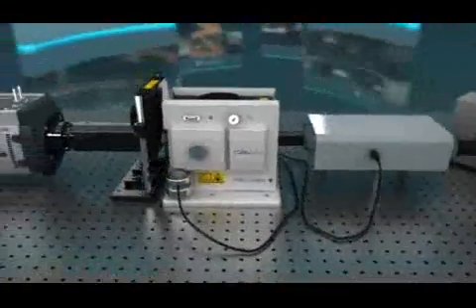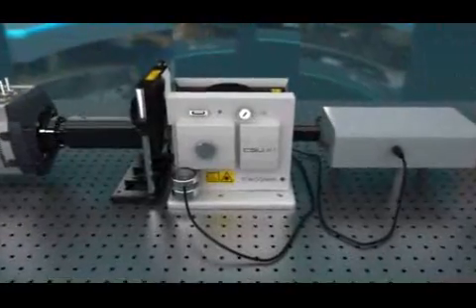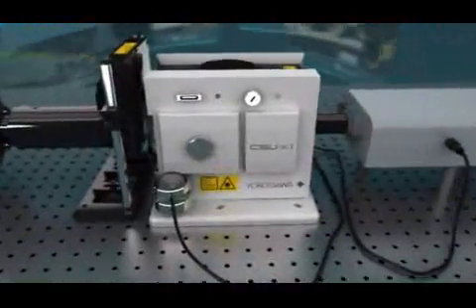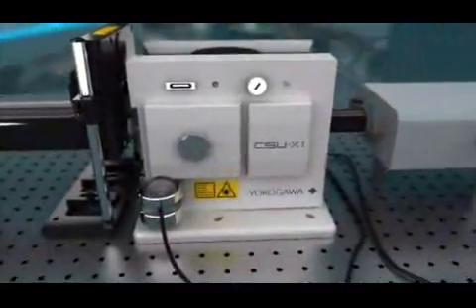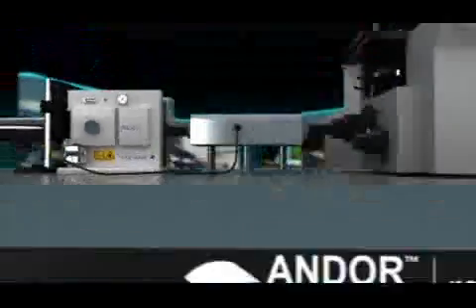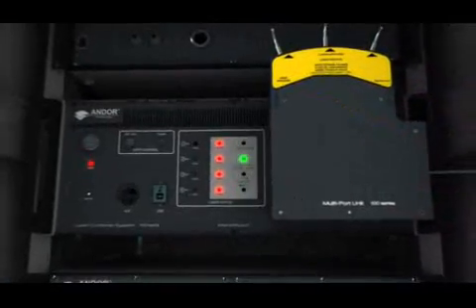Confocal scanning is achieved with the Yokogawa CSU-X1 latest generation dual spinning disc. Excitation is supplied by Andor's ALC laser combiner.